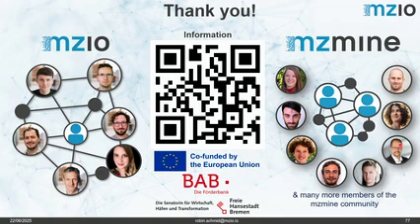I mean, that's what Robin showed before. In mzmine, you can basically select which library you want to download, but you can also go to Zenodo or GNPS. They are uploaded there. We are also working with MassBank EU to upload them there, so you can just import them, and then you have multiple libraries in mzmine or whatever tool you want to use.